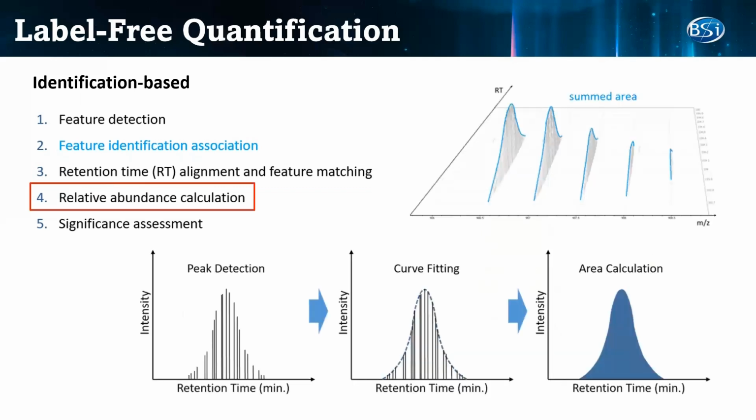For DDA acquisitions, peptides are quantified based on MS1 feature abundances. The peptide feature area is determined by drawing a curve over the peptide elution and calculating the area under the curve. The sum of the areas for each isotope make the peptide feature area. By default, for DDA, the three most quantifiable unique peptides are used for the protein ratio estimation.